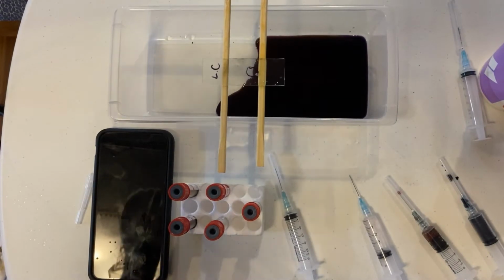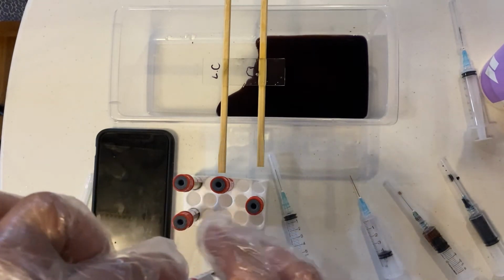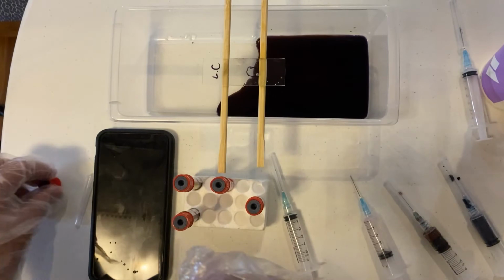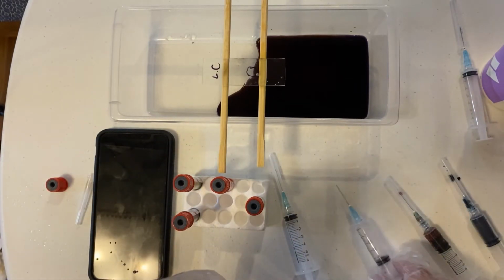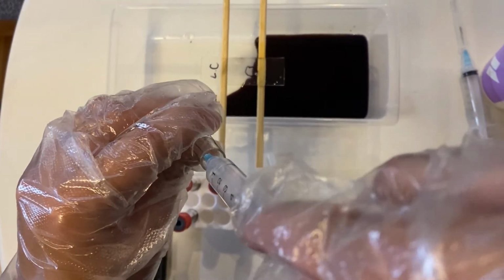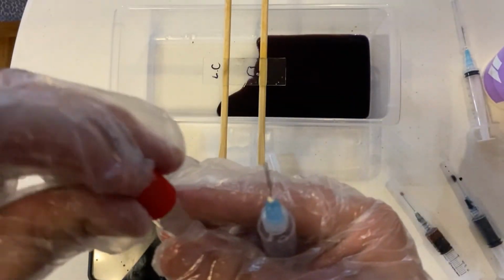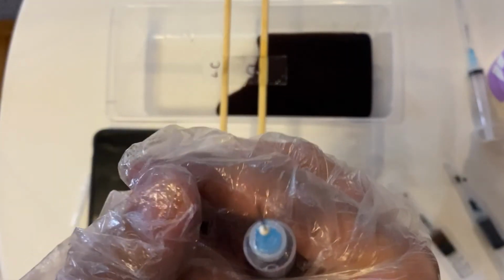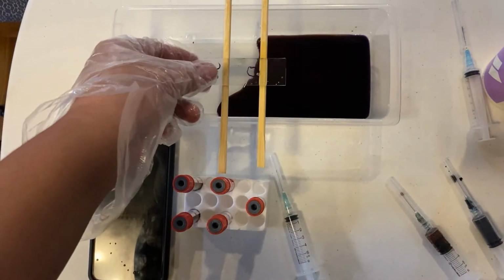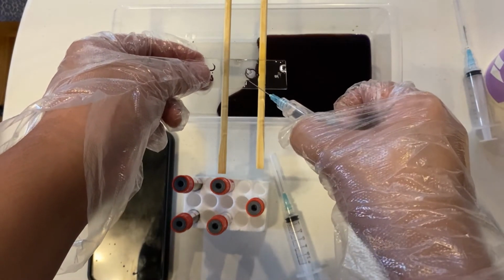Next, we will use a decolorizing agent, which is usually 95% ethyl alcohol. Gently flush it on the slide. This will remove all stains in the slide.